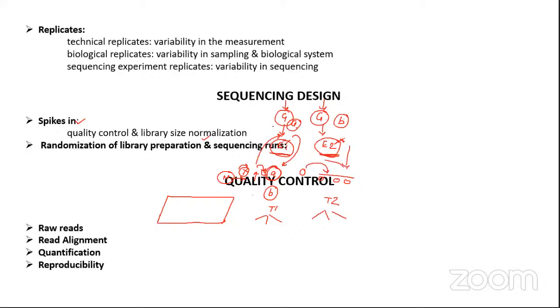This is a biological replication, and one should not avoid this. But when we are doing method validation or method development, along with this we have to take technical replicates also, to avoid method errors. Say suppose I am plating my cells in 3 plates.